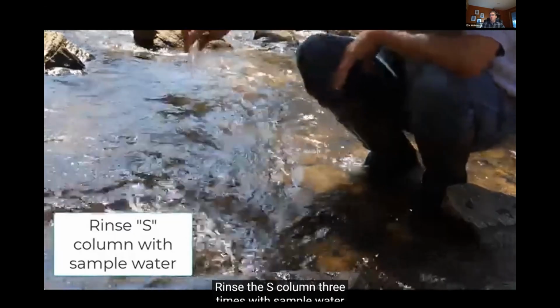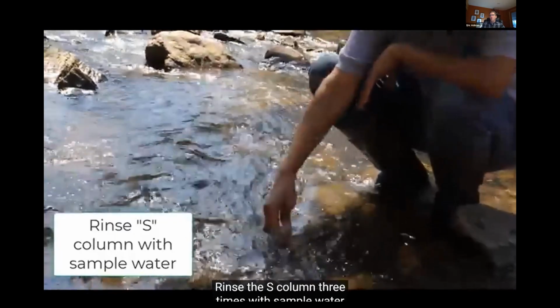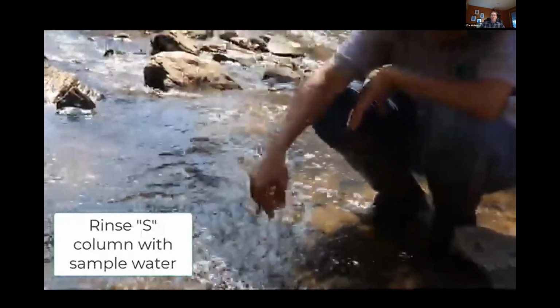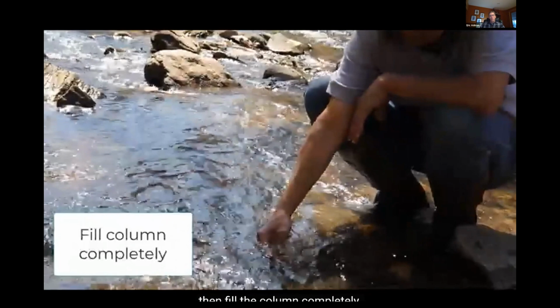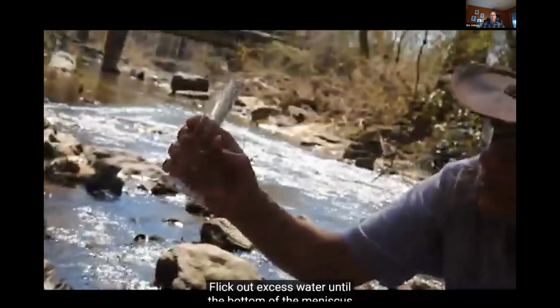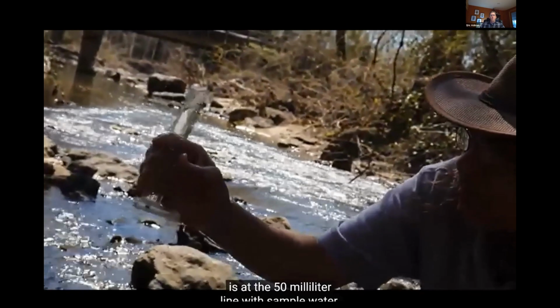Rinse the S column 3 times with sample water from the water body. Then fill the column completely. Flick out excess water until the bottom of the meniscus is at the 50 milliliter line with sample water.